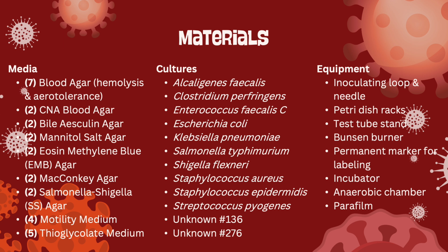For cultures, we used Alcaligenes faecalis, Clostridium perfringens, Enterococcus faecalis, Escherichia coli, Klebsiella pneumoniae, Salmonella typhimurium, Shigella flexneri, Staphylococcus aureus, Staphylococcus epidermidis, Streptococcus pyogenes, and our unknowns were number 136 and number 276.